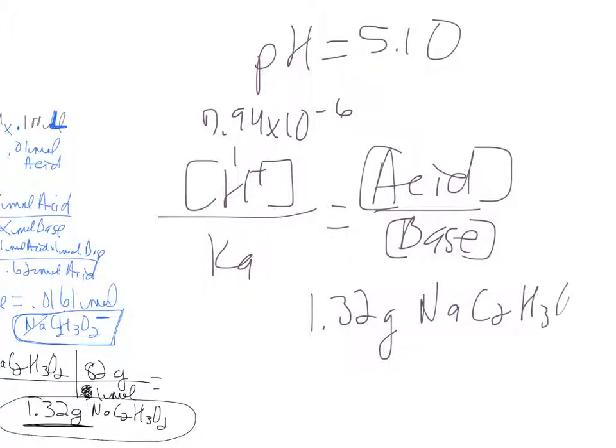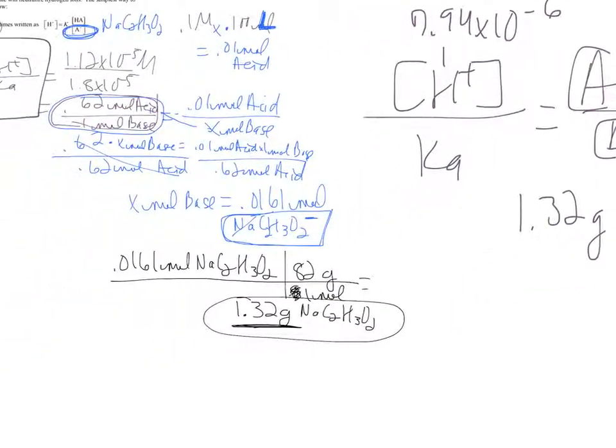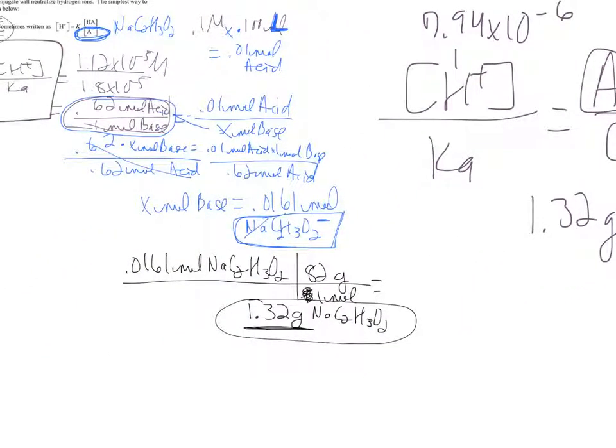And the only thing you have to be careful of is on your third buffer, the one with the asterisk. It's the exact same setup, but you just need to be careful that the molar mass is the molar mass of sodium hydroxide. That's the only difference. Your base is a strong base, not the weak salt base. And that's it. That's all you had to do to calculate, and then you just made your solutions, and then I would check with a pH meter. And that is the lab.